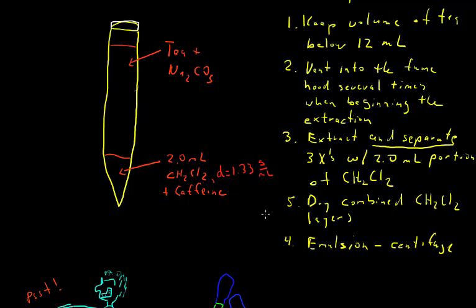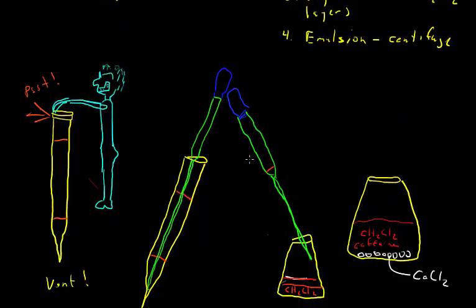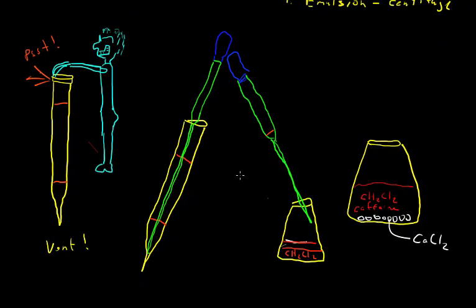In other words, you may get a little bit of dichloromethane dissolving into the tea and a little bit of water in the dichloromethane. And even if you didn't, it's probably likely that you're going to get some aqueous solution into the organic phase when you're separating them. And so we need to get the water out of the organic phase, away from the caffeine, so that we can isolate the caffeine. Now if you get little droplets of the tea in here, you can try to pull those out as much as you can with your Pasteur pipette.